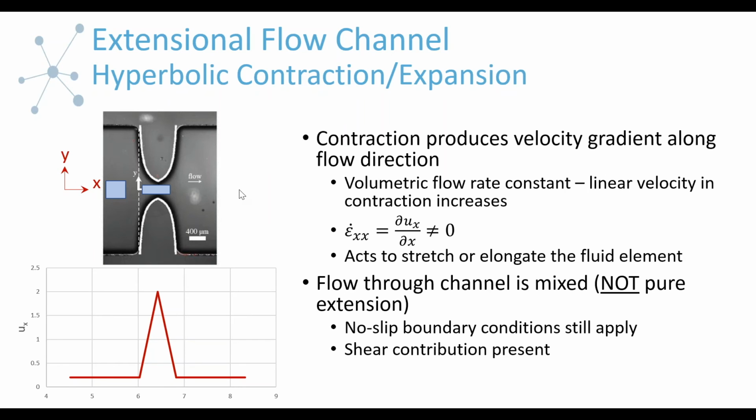Okay. Well, there's a follow-up question then: can you go as high as 25? My colleague who's sitting next to me was telling me that we have customized in the past. So right now we don't. Because we control temperature, and temperature is very important in viscosity measurements, you would need a syringe jacket to fit the 25 milliliter syringe. And we don't consistently make those, although this is a custom option if that's important.